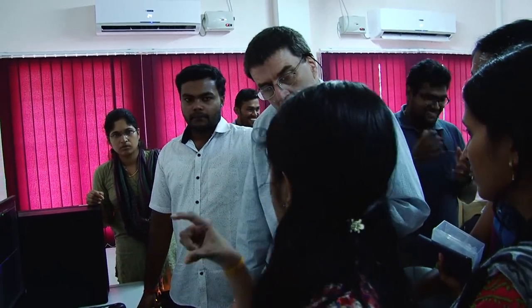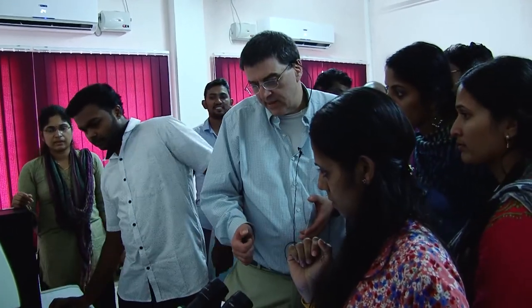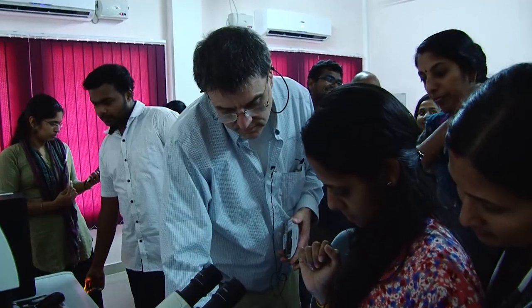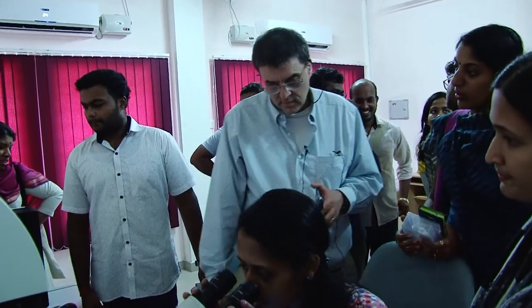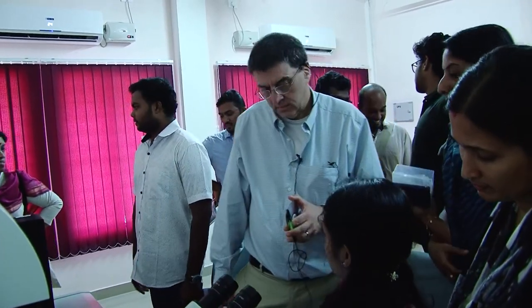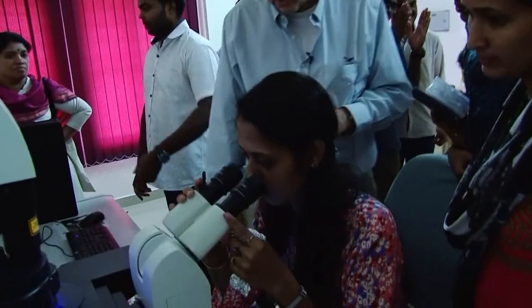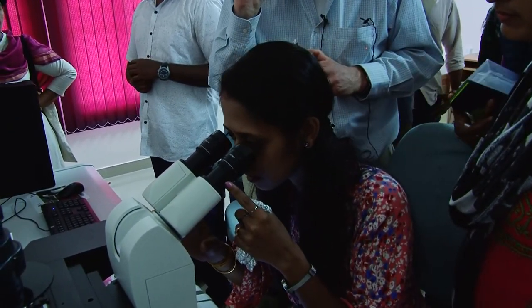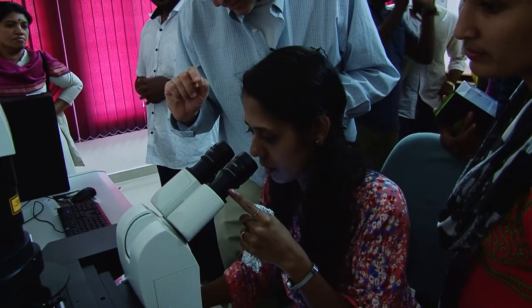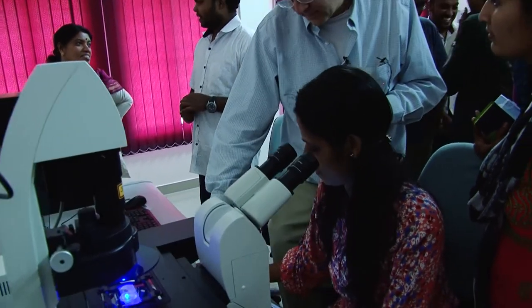I can't take a single cell image without bubble. Let's, so take a look. Okay, let's go back to your eyes. Let her go back to the eyes. It's hard because you got bubbles everywhere. Go ahead, take a seat. See if you can find something. Shutter. You see it? Not seeing something. How about now? You see something? Yes. Do you see anything? Okay. Yes. So now how about now? Yeah. Okay. So X, Y in focus.